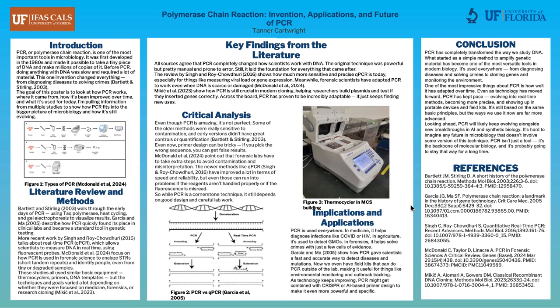So, PCR is used everywhere. I thought it was really cool in the lab. I did the in-person version, but they showed us the little PCR machine that they sent home, which I thought was really cool. I didn't know that it even existed, but I suppose now, knowing a little bit more about it, it's really not that complicated of a thing. It's more just knowing what you're doing.